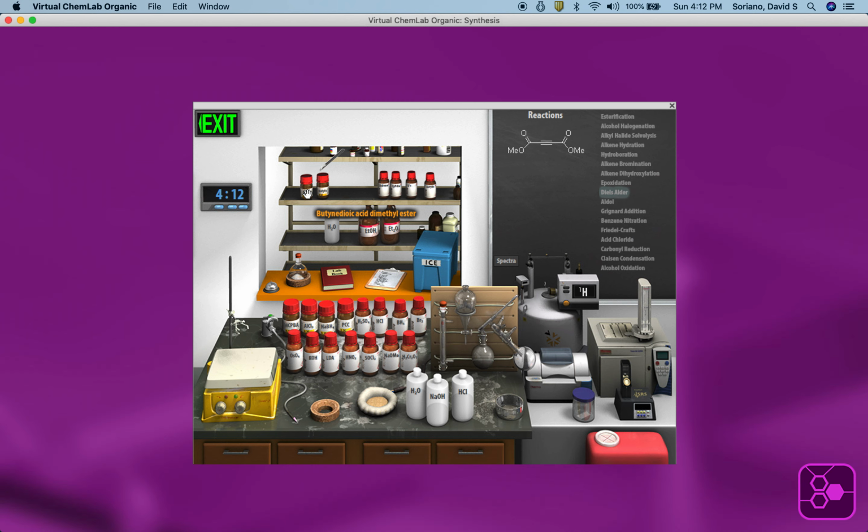And the conjugated diene we'll use is cyclopentadiene. That's usually made by cracking a dimer at a high temperature, over 200 degrees, and using it in situ. I'll double click on that. See the color when you mix them. And I'm going to do it in a nonpolar solvent, represented by diethyl ether. There are your 3 materials in the round bottom flask shown on the blackboard.